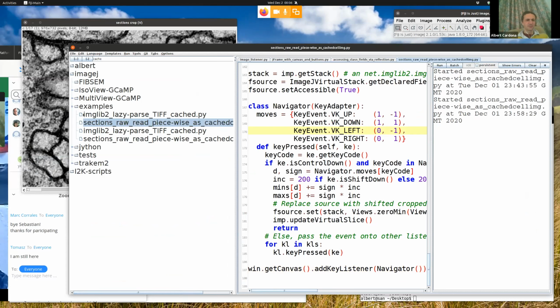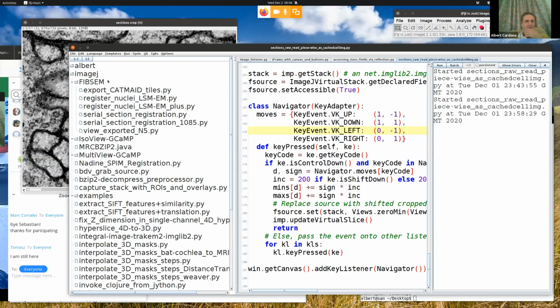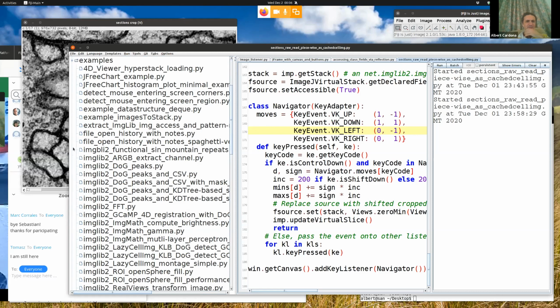So where is that? I'm pretty sure this is under Weka. No? Oh, come on. Is this case sensitive? No. Goodness, I forgot where the script is. I need a moment, please. I'm pretty sure it's here.